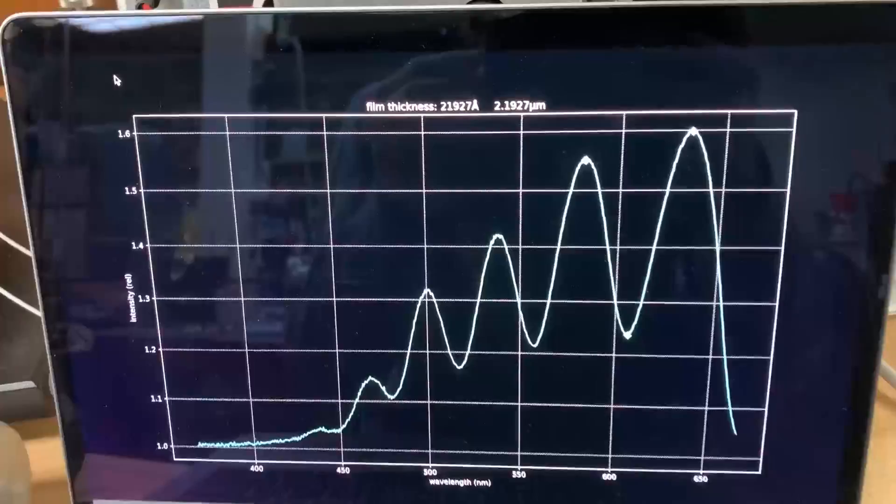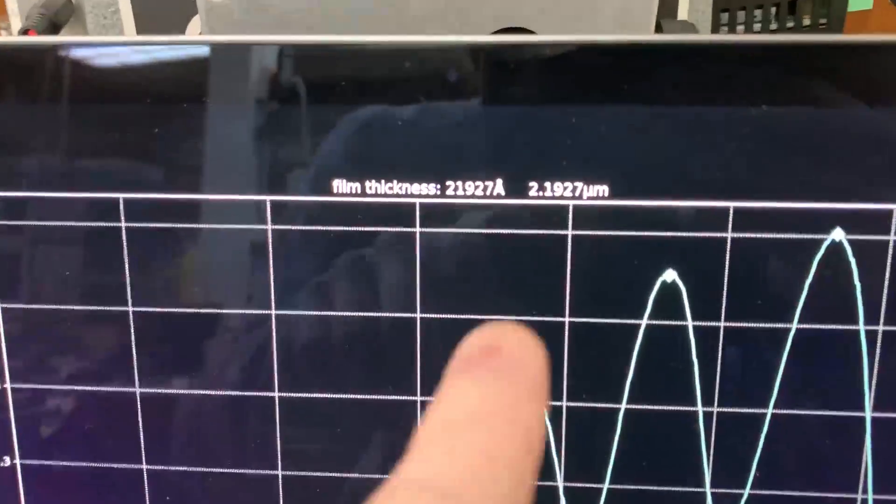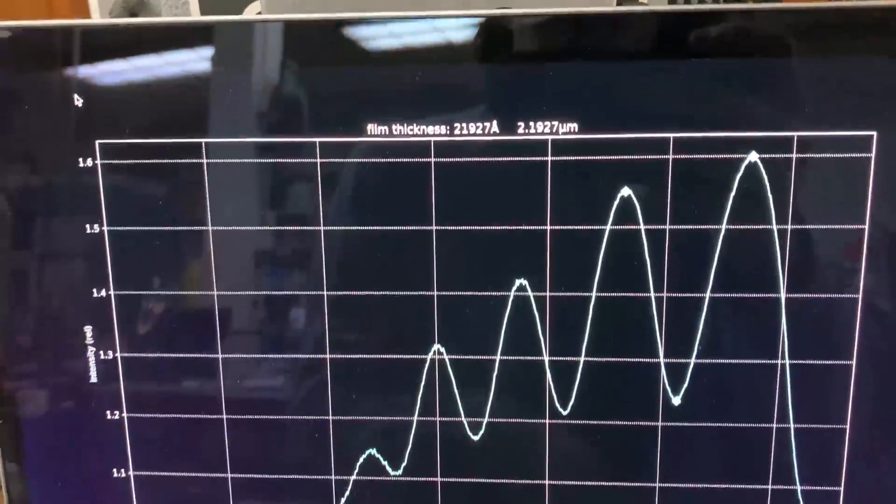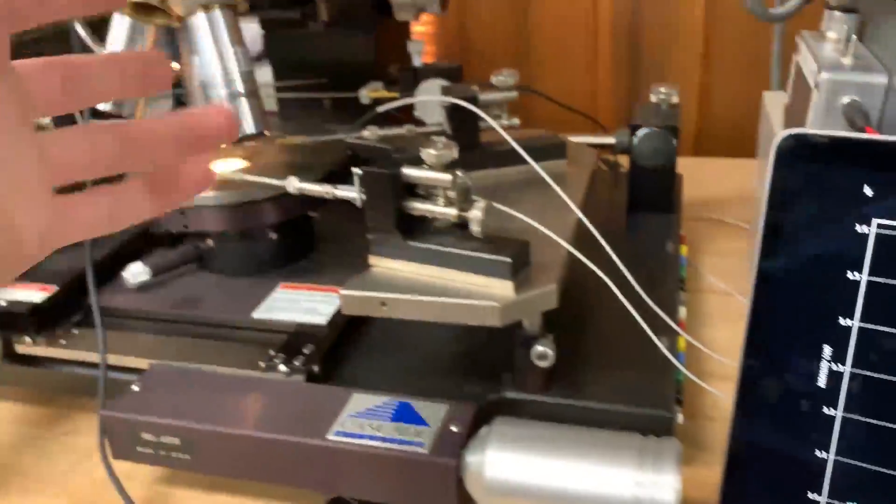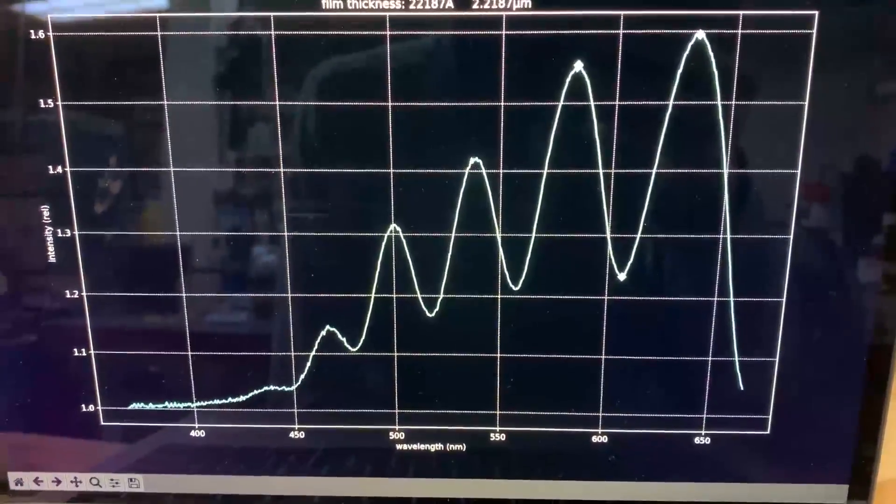Let me head over to the same python script from before. It's correctly identified like these peaks and then we can see that it says the thickness is a little over two microns which is great. That's within the margin of error of the rpm of my spinny thing, the viscosity of the resist, the measurement error of everything. So I'm good with that and that shows that it's working quite well.